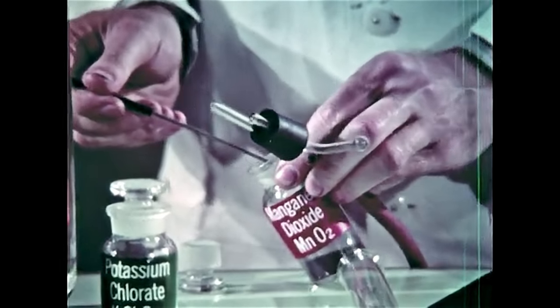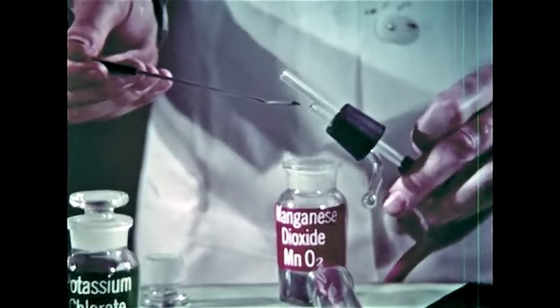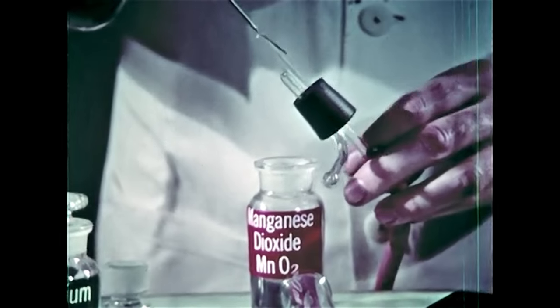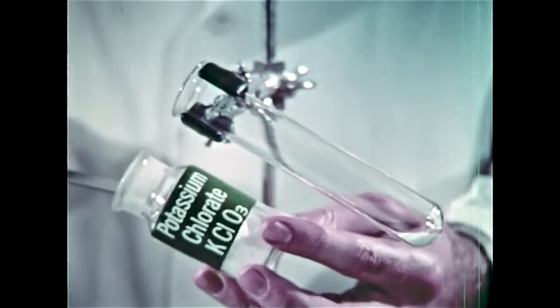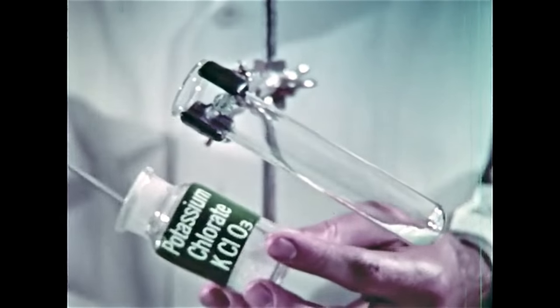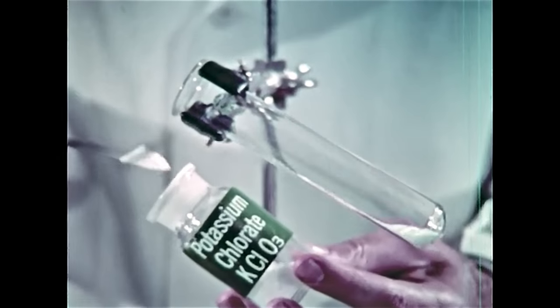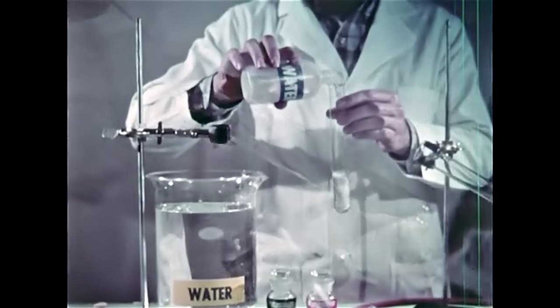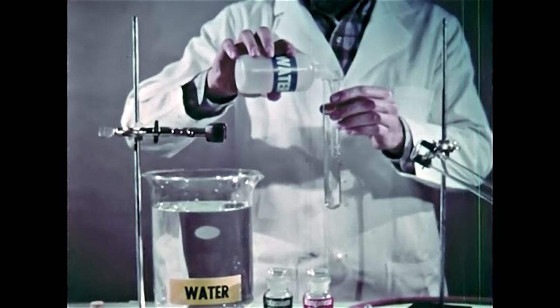First, the catalyst is put into this bulb so that it can be added later. Then the potassium chlorate is put in a test tube for heating. Finally, the second tube for the oxygen is prepared.